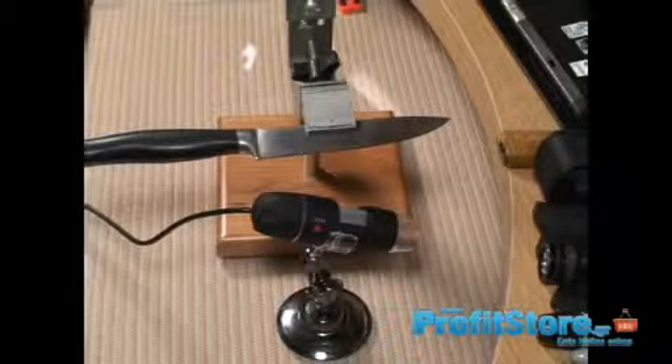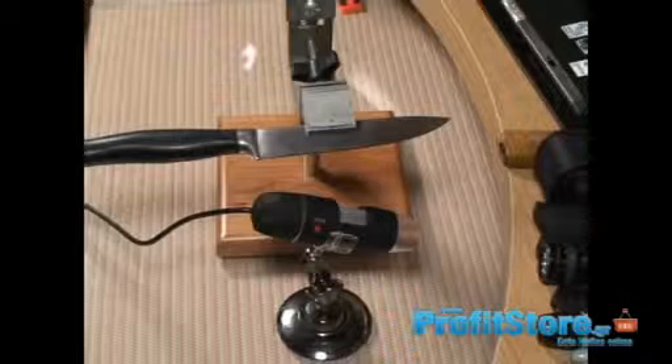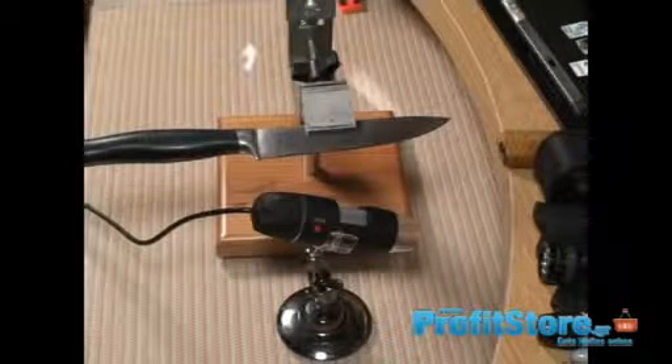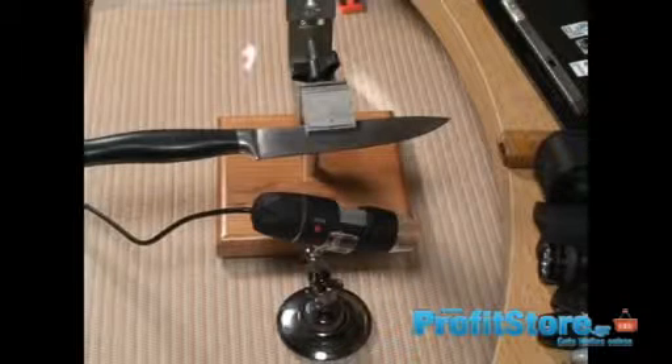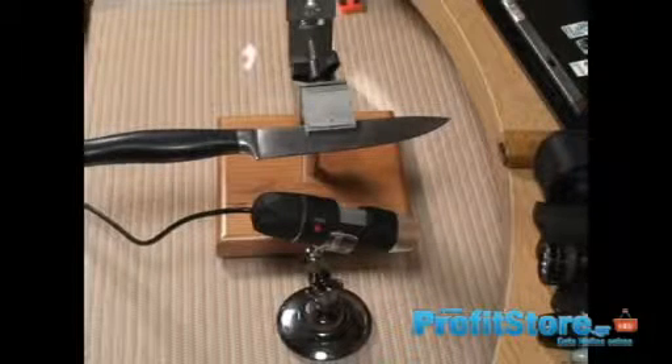Hello, YouTube friends. This is just a really quick video to show you my new USB microscope. My expectations were not high — actually pretty low — because when you spend about $25 including shipping on a product, you're not going to get anywhere near top of the line.